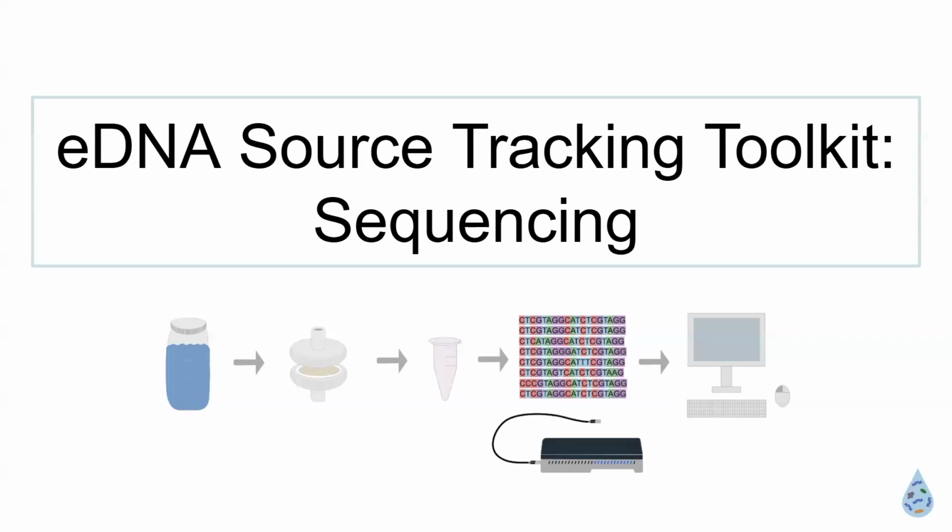And then when you're doing extractions, you can't fit a whole big filter, or you shouldn't even fit a whole small filter, into the extraction tube. One, to make sure that if something goes wrong during the extraction, you have enough left to go back to, and two, so that you can do multiple extractions to have extraction replicates and make sure that those are consistent as well. So replicates for everything.